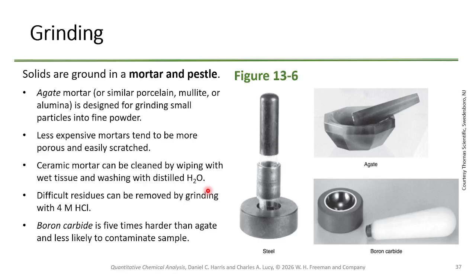Yeah, it's going to stick inside. Everybody notice that our mortars and pestles have coloring to them? Everybody notice that when you used it? Why is that? Yeah, they're not super expensive ones. They're fairly cheap ceramic ones, which is fine for our purposes. But it does mean if you're not very careful and you use certain things, they are porous enough they can absorb materials. Even up to the point of absorbing spinach chlorophylls.